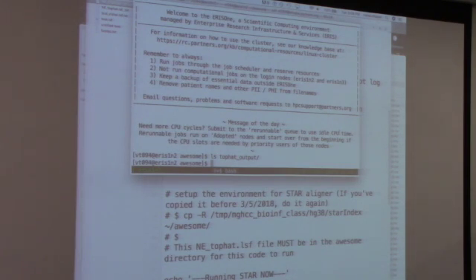So technically you could run it, and in this case there's not too much of an issue because it's a short file. But ideally, you don't want to run it on the login. So what we'll do is copy this into our test.lsf. Oh, that's where it is. Okay, so then you remember bsub -q normal, and you pass the file test.lsf.